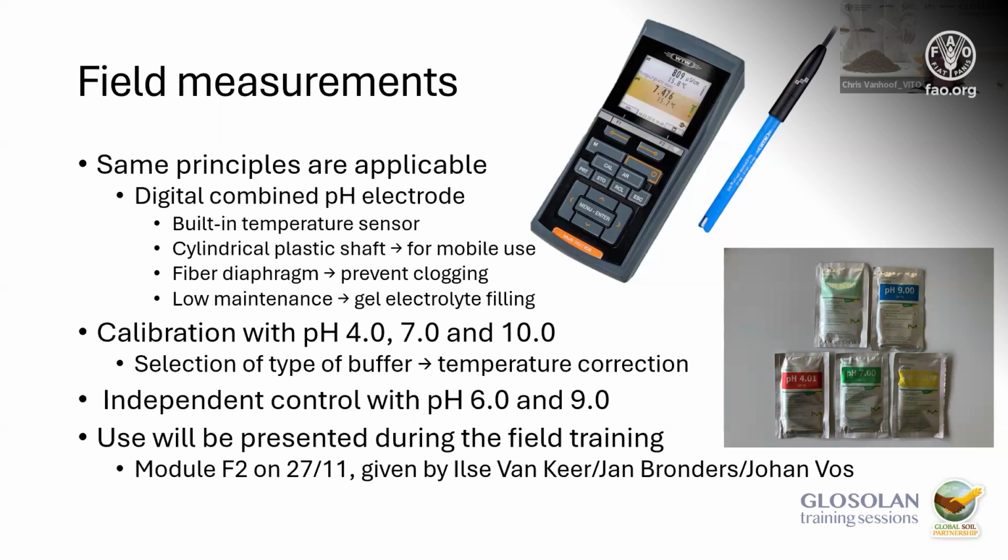The use of this pH electrode and measurement instrument will also be demonstrated during the on-site field training. This is given in module F2 on the 27th of November, and it's given by our Vito colleagues. They will also demonstrate this application.